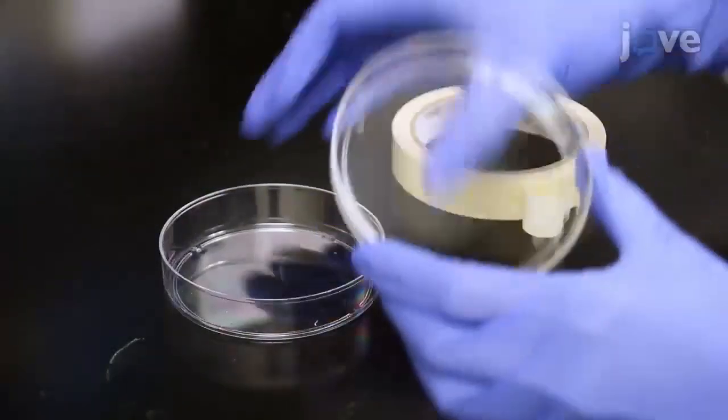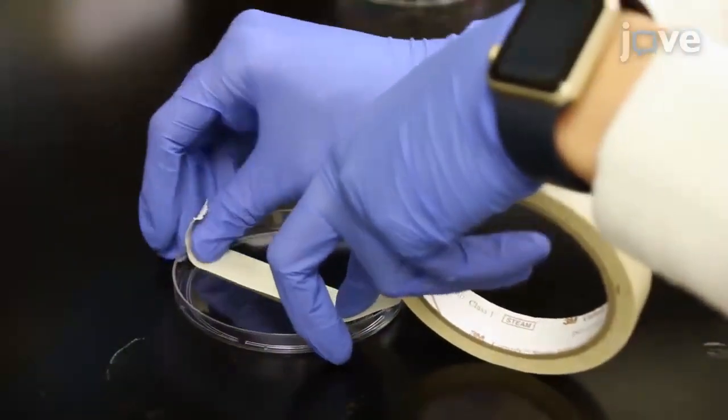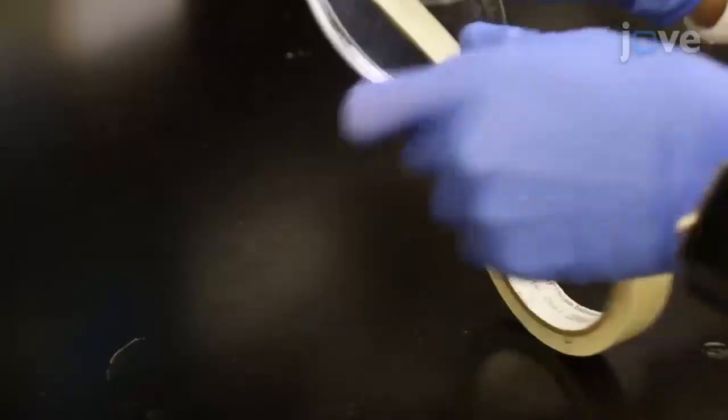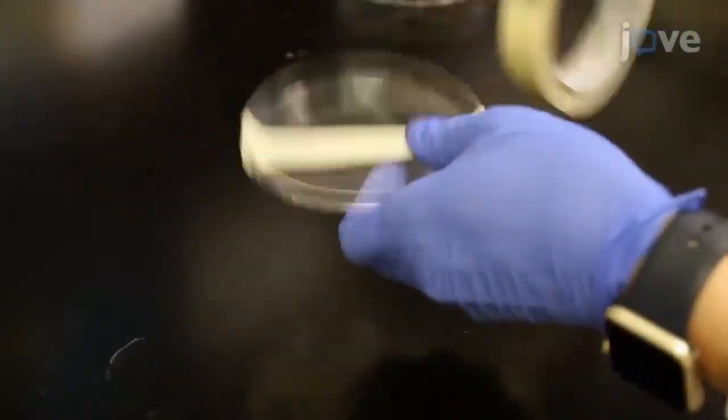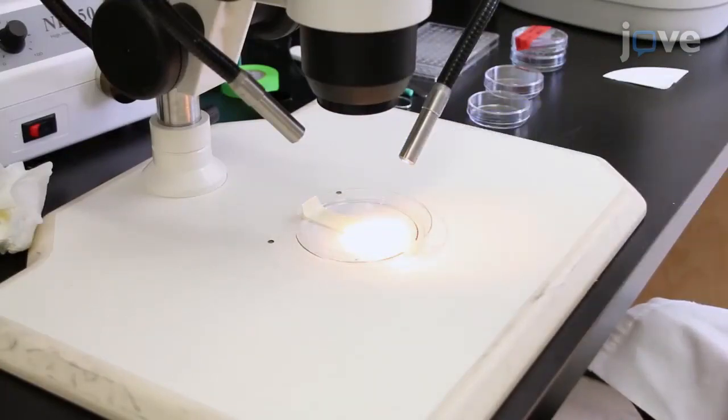Prior to starting the fin clipping of the zebrafish larvae, prepare the dissection surface. Tape a piece of autoclave tape across the interior surface of a 9 cm petri dish lid and position the lid under a stereo microscope.